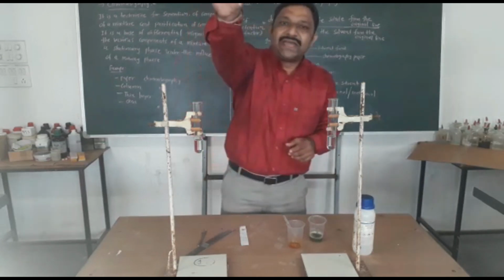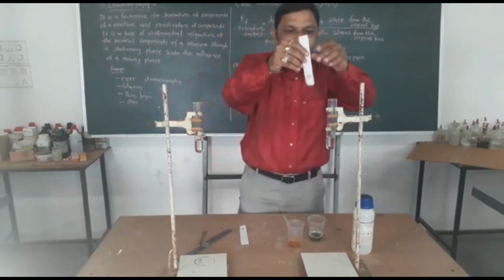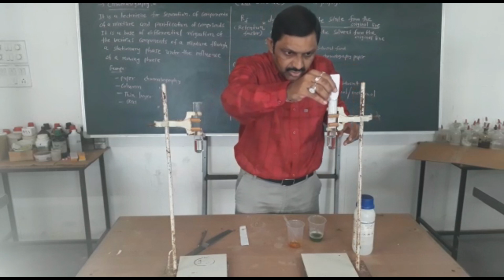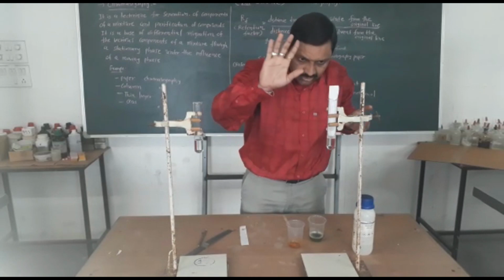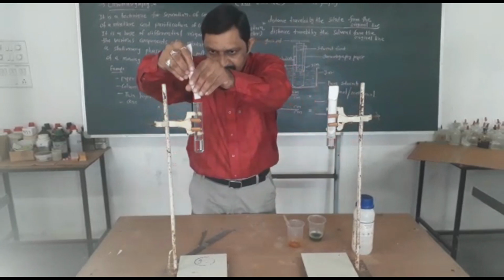So here is spinach, and we put it into our test tube, lower end deep in the solvent. So the solvent will rise up.